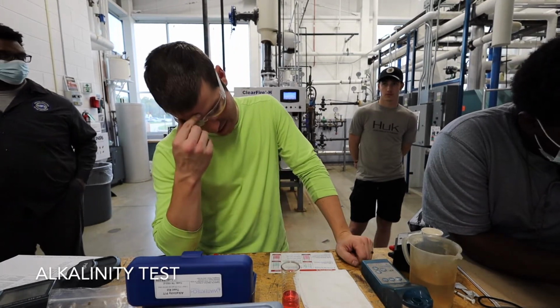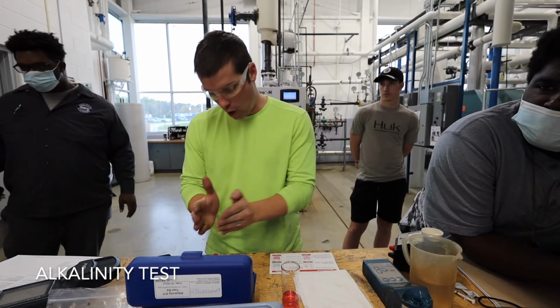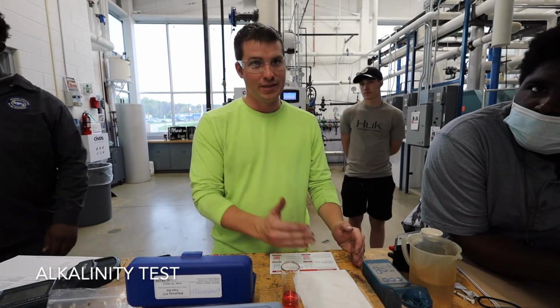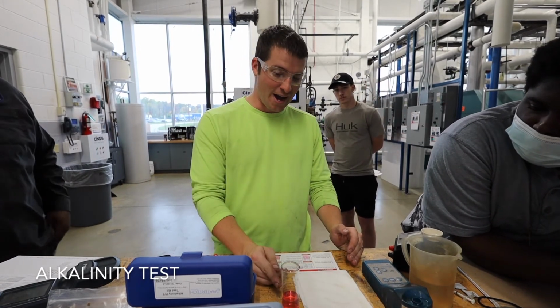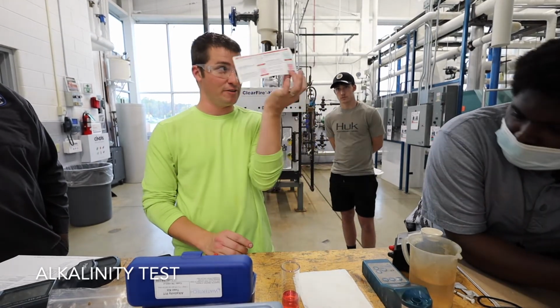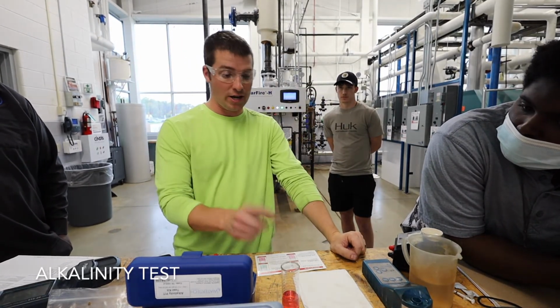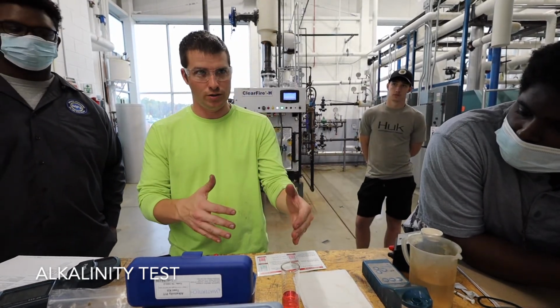God, this is so confusing. All right, I'll try to make this as simple as I can. P, M, O alkalinity. P and O alkalinity are a portion of M. M is your total alkalinity. So that's fine. We want that to be our endpoint. Step 5, it goes back to pink. What that means is if it didn't turn green, our endpoint is that. So our endpoint is 200.